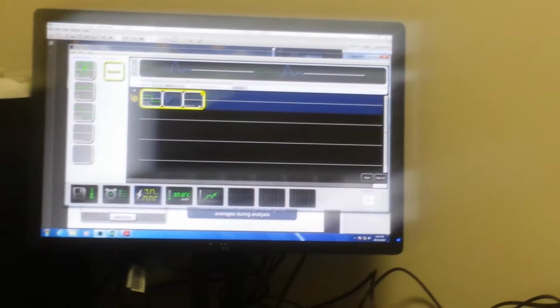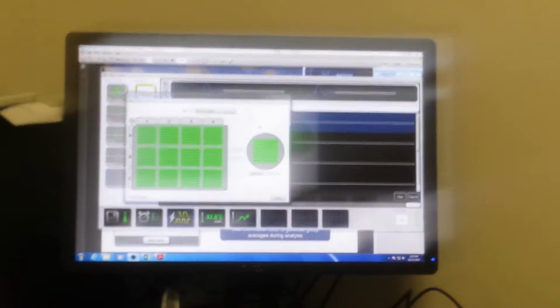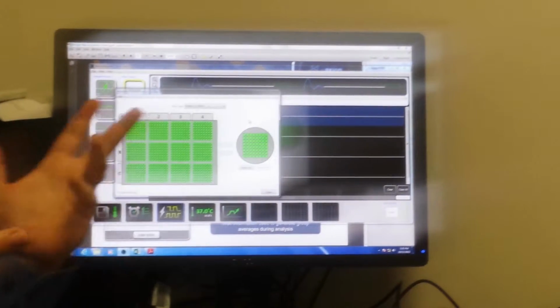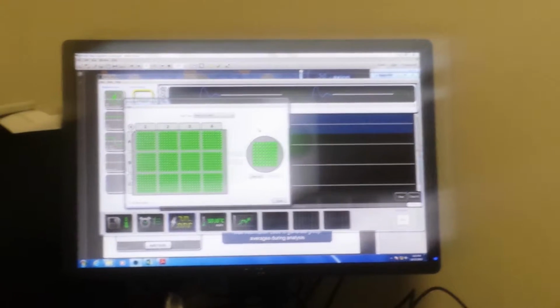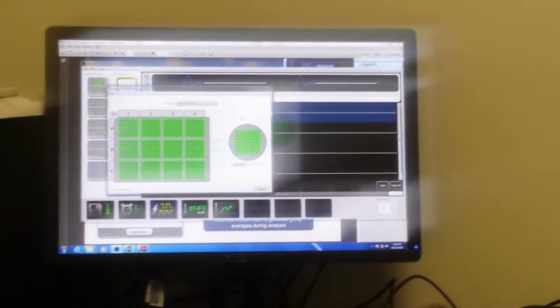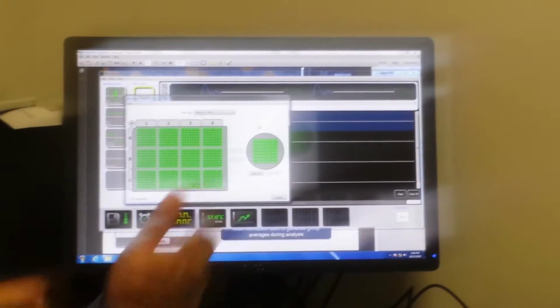for an action potential. So can you adjust for current? The only thing we can measure is the extracellular voltage. Okay. Yeah, it's the sum of the voltage over the area of the electrode.